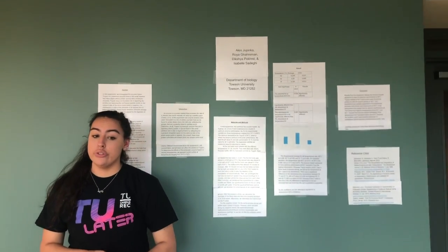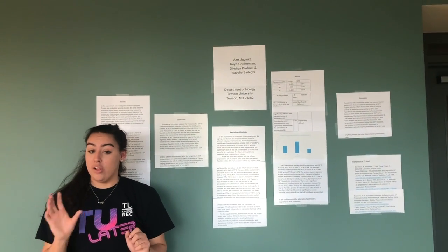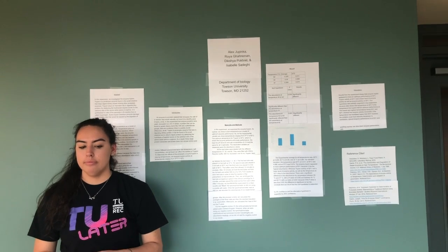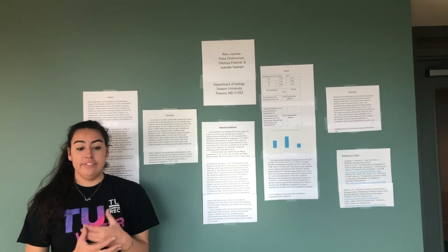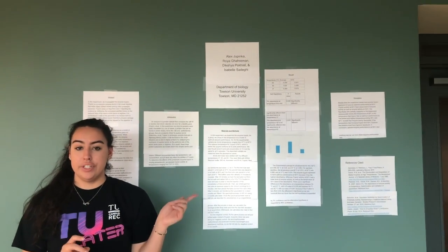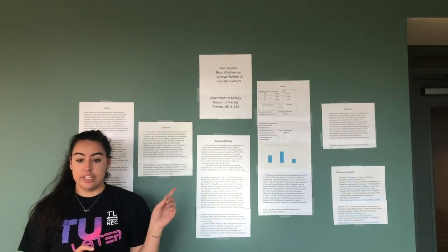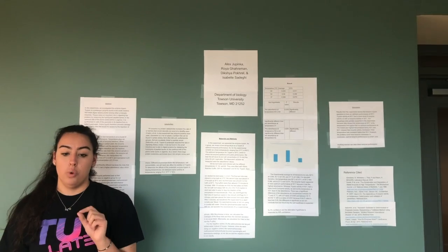So our t-test results showed that the absorbance at 50 degrees Celsius and 37 degrees Celsius, as well as the absorbances at 50 degrees Celsius and 62 degrees Celsius, were significantly different. The key results in variability of our experiment was that there was a significant difference in absorbances between 50 degrees and 37 degrees Celsius, with a p-value of 0.036, and between 50 degrees Celsius and 62 degrees Celsius with a p-value of 0.001.